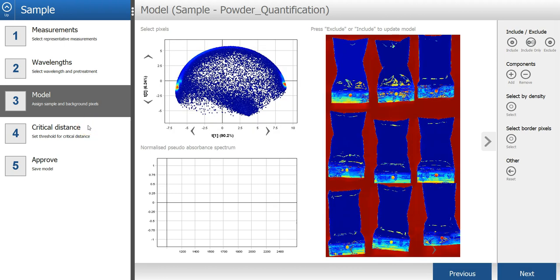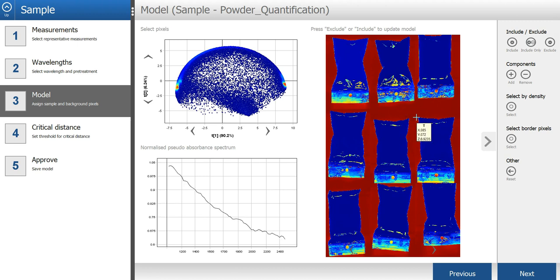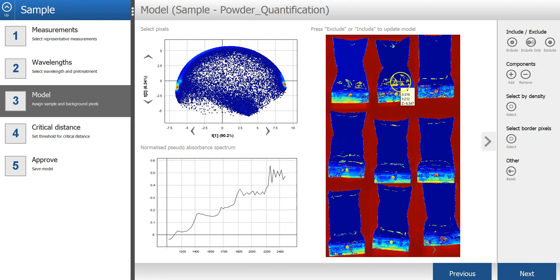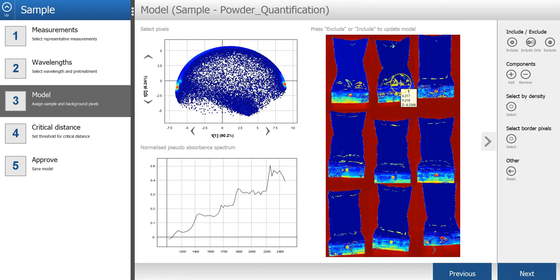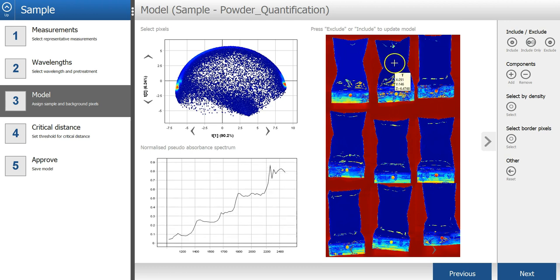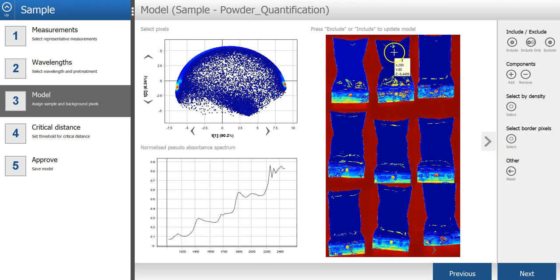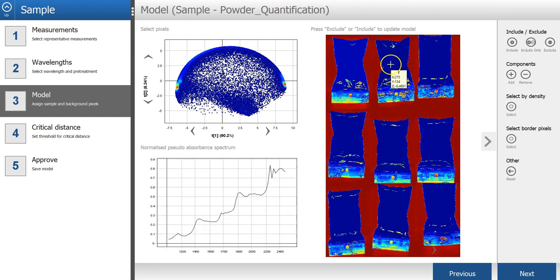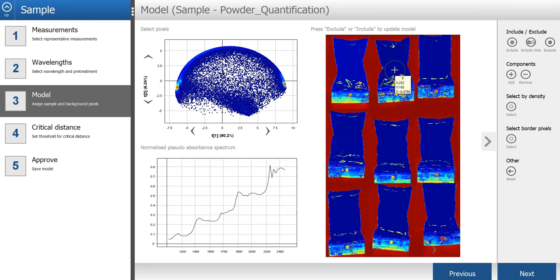In the next step, a mosaic has been created of the nine images. And a PCA model has been created from all the pixels in this mosaic. The goal here is to select and include only the pixels that belong to the samples, which will then be used to make the sample model.